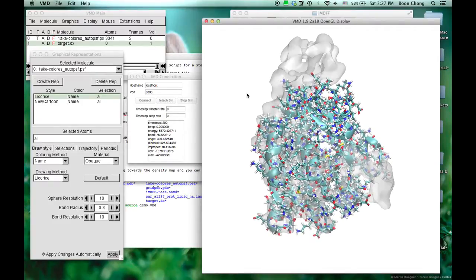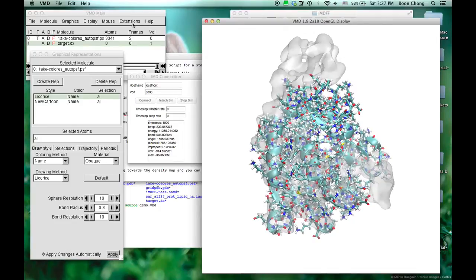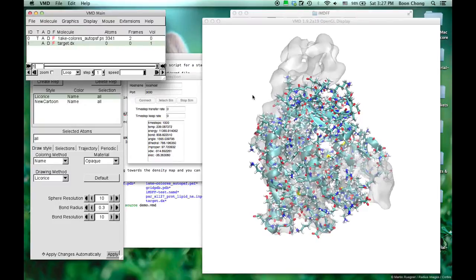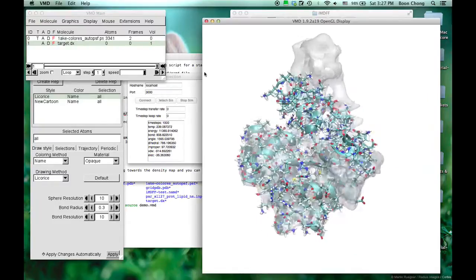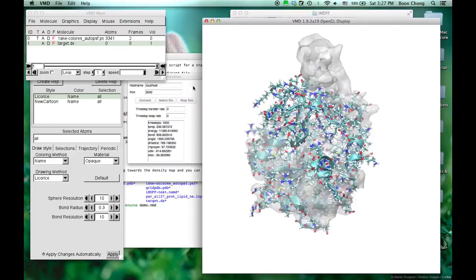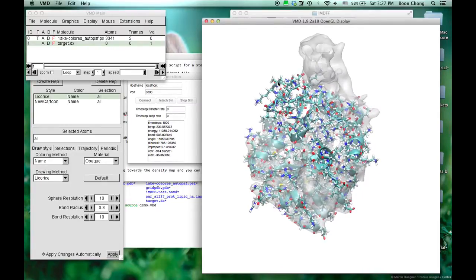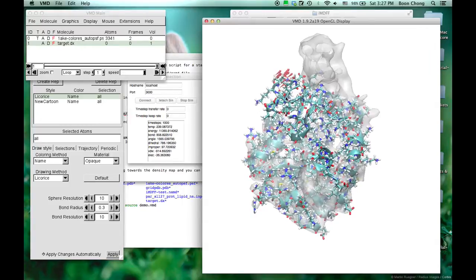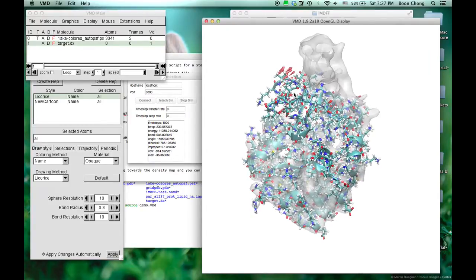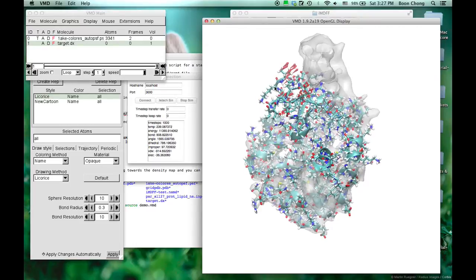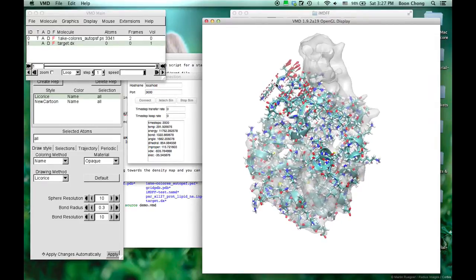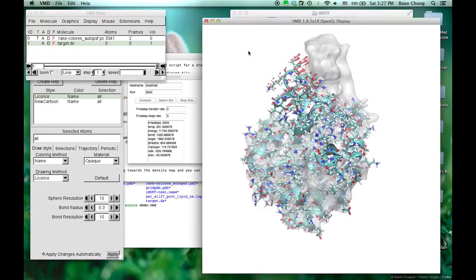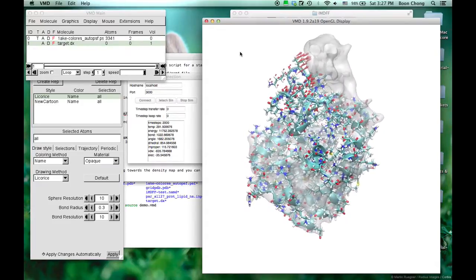To interact with it, you can use the mouse and apply a force by residue. Because at this stage it's kind of obvious where we should go, we just point to a residue and then drag a force to it. It will really quickly go into the direction that we asked it to go into.